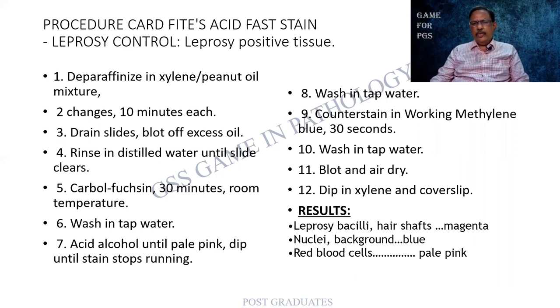This is another use of the xylene. It can be used as a clearing agent. It can be used for deparaffinizing. It can be used for mounting also. In fact, DPX is distrene dibutyl phthalate xylene. The results are the leprosy bacillus takes up a magenta color, nuclei in the background a blue color, and the red cells pale pink in color.